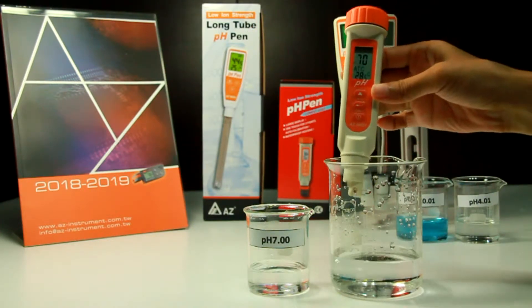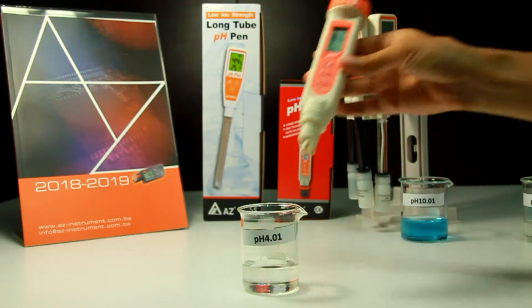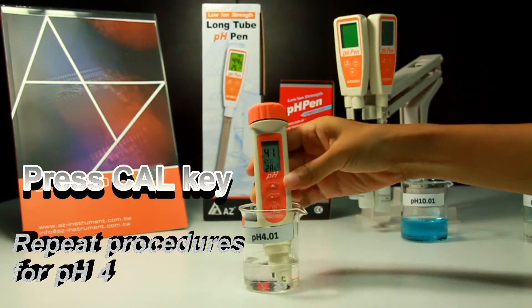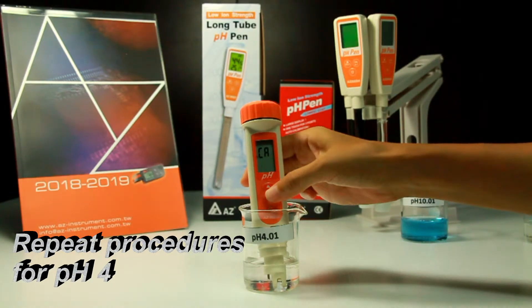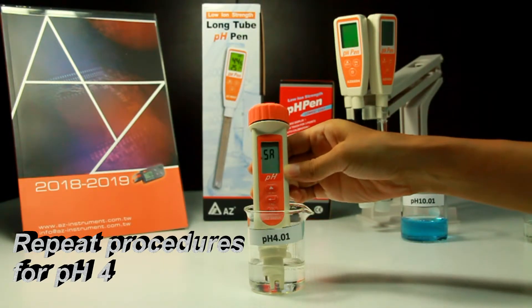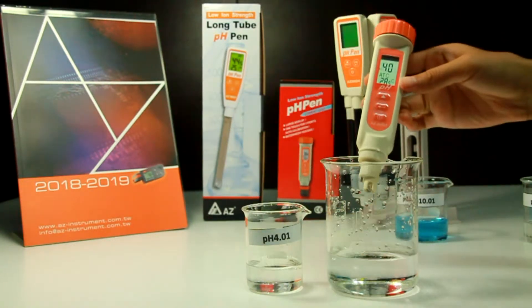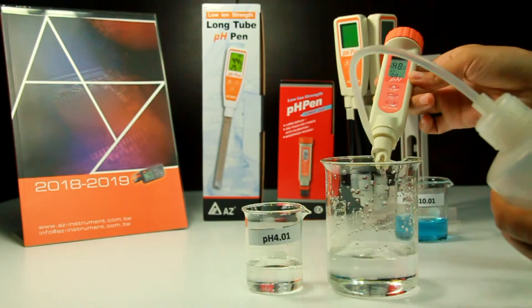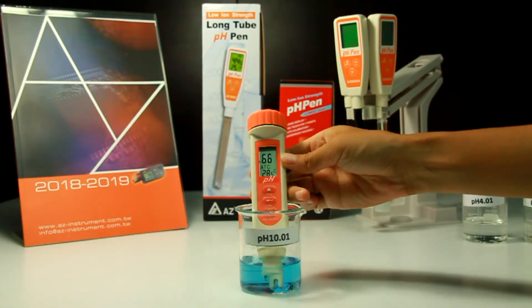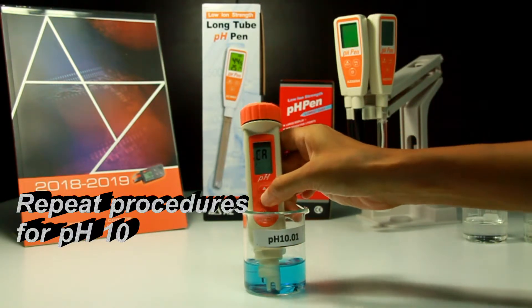Clean the electrode with water and blot it — do not wipe it. Then immerse it into the next calibration buffer. Repeat the above steps and press the calibration key again when the PH pen is stable in the new buffer. Stir gently until the reading is stable and you will see the save icon and end icon appear on the display. Repeat this process for any additional calibration points.